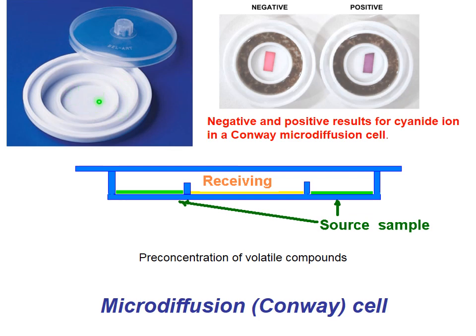In the center, you are putting pure water or some suitable receiving phase or simply indicator like here. So volatile compound is coming from this area into this area and reacts with the reagent you want. Alternatively, you collect this phase and analyze it by any means.